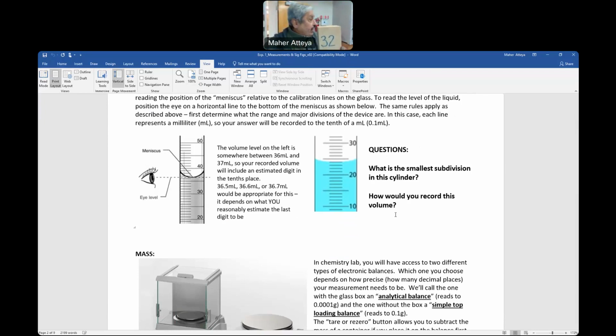Right? And the volume will be the multiplication. Okay, the multiplication of those three: length multiplied by the height multiplied by the width. So the whole idea of the whole experiment is to learn how to use some tools, such as a ruler, how to read the graduated cylinder with liquid in it, and how to measure the volume of a solid. Determine this one here, and then determine the significant figures of this value.